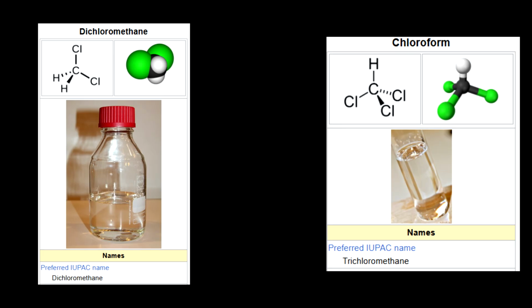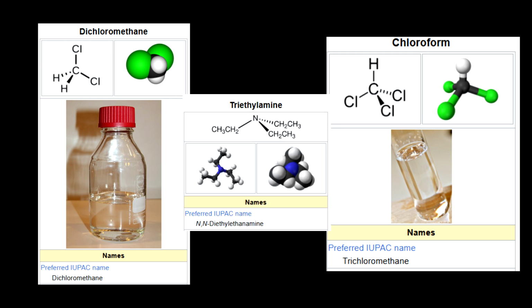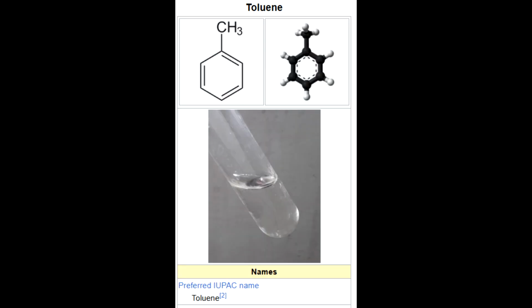For the synthesis, you also need solvents, dichloromethane and chloroform. All reagents except oxalyl chloride need to be dried. The reaction is very sensitive to water. Water in the solvents significantly reduces the yield. I didn't dry anything and then deeply regretted it. Some people use toluene as a solvent, which is easier to dry. Unfortunately, toluene is hard to come by here, so I use dichloromethane as a solvent.